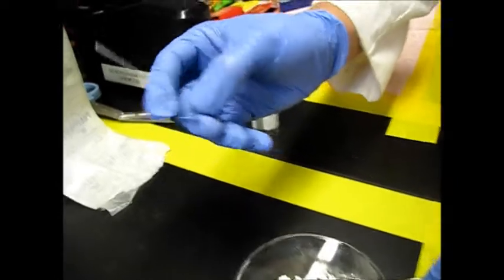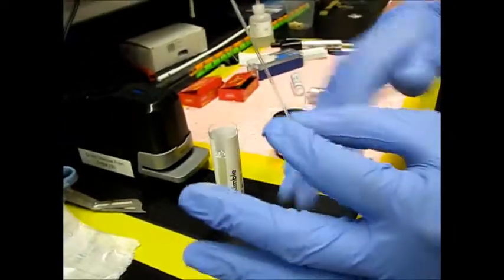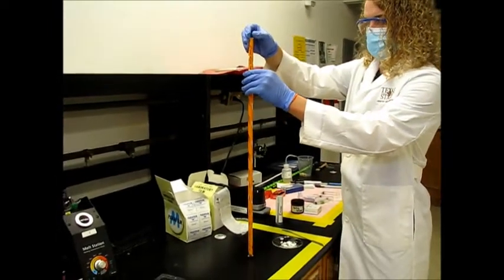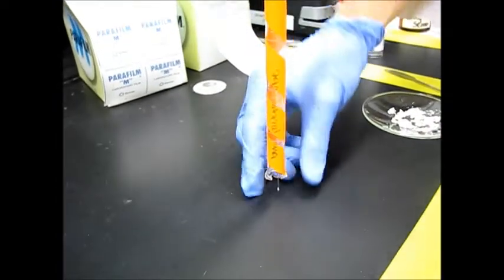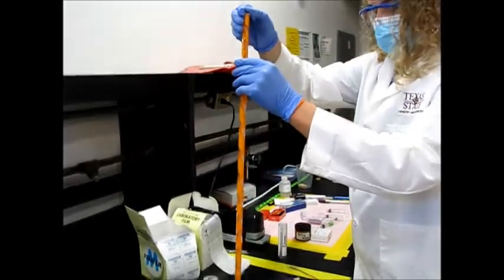So once you get a good amount, we're going to use an old burette to bounce all of this stuff down to the bottom. The way we do that is hold this up here, and we're going to drop it in at the top. That helps force everything down to the bottom. Looks like it's mostly down there. We're going to go one more time.